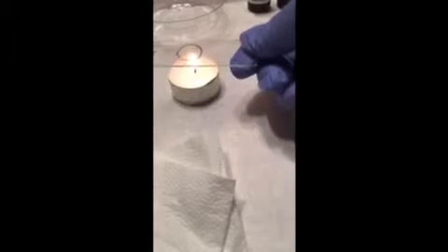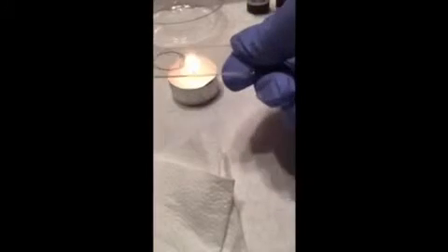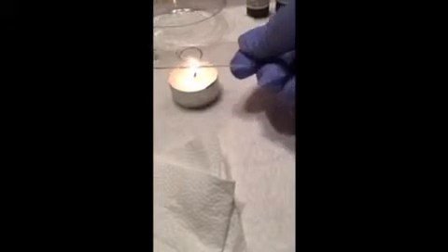Give me a couple seconds to dry. Passing it around 5 times, you're heat fixing the sample. We're supposed to let it dry for 10 minutes.